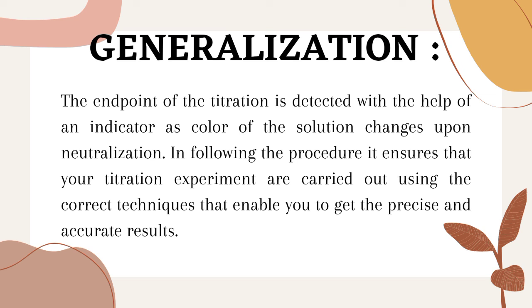Generalization. The endpoint of the titration is detected with the help of an indicator, as the color of the solution changes upon the neutralization. Following the procedure ensures that your titration experiments are carried out using the correct techniques that enable you to get precise and accurate results.